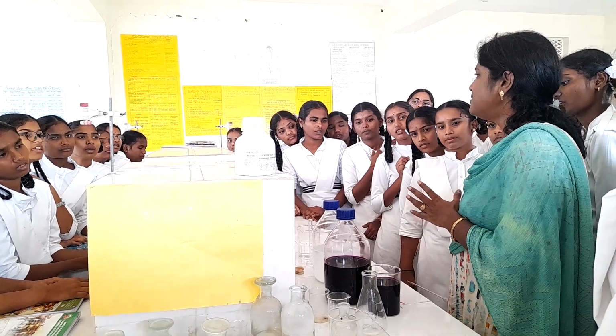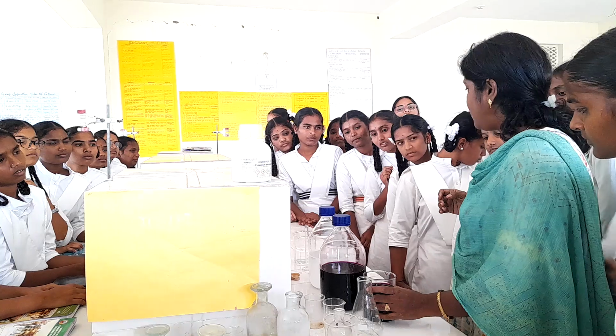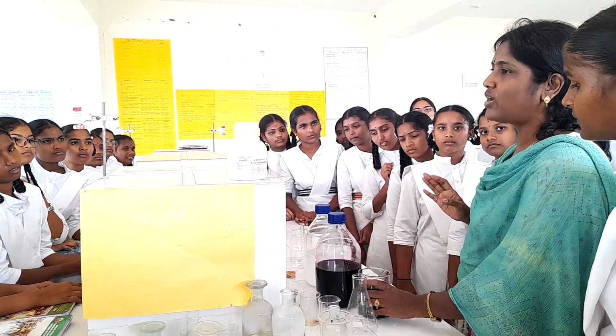Is everything clear? Yes, ma'am. Shall we start? Yes, ma'am. Okay, go ahead and fill your burettes and titrate accordingly.